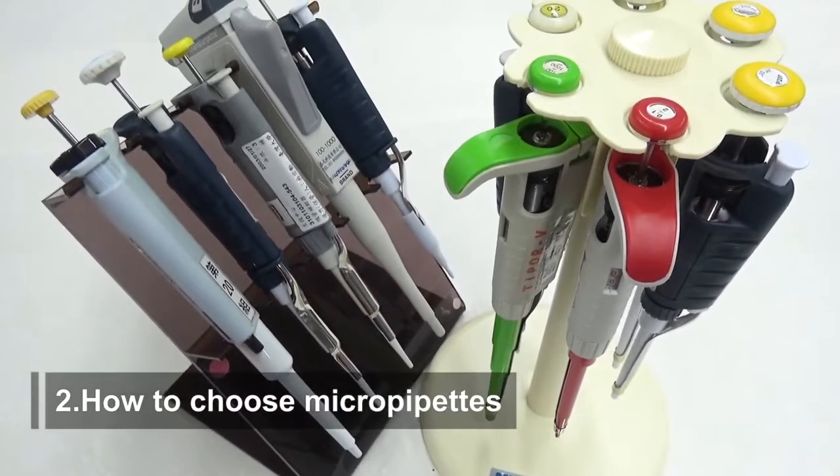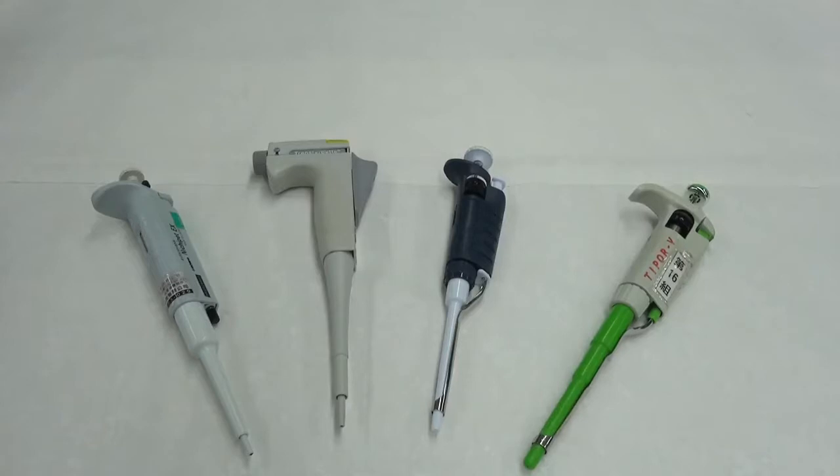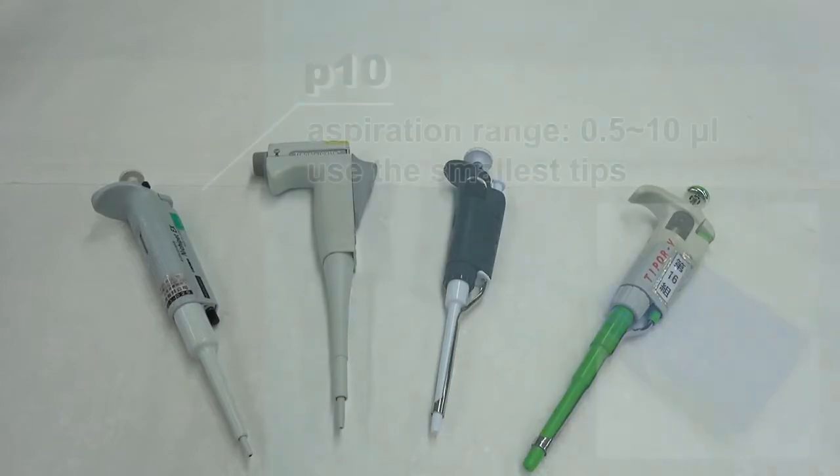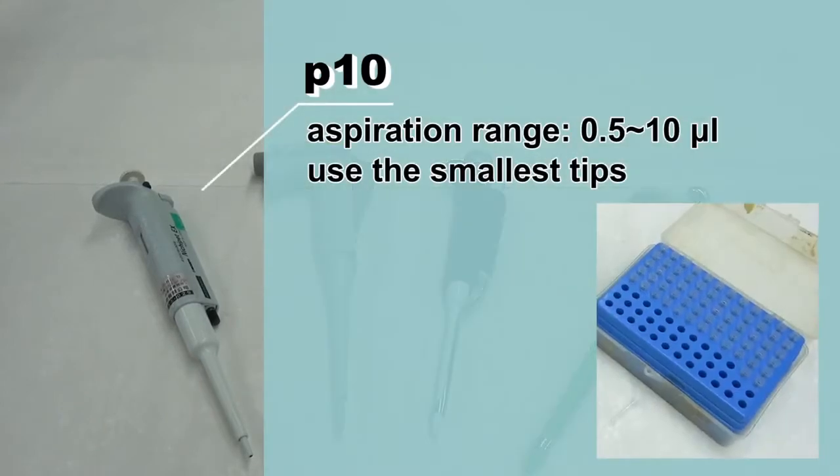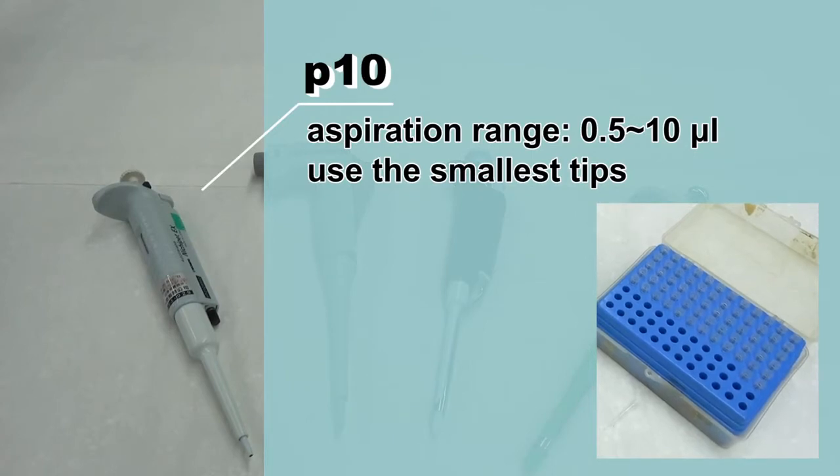How to choose MicroPipets. Regular MicroPipets include four types. The P10, which has an aspiration range of 0.5 to 10 microliter and uses the smallest tips.